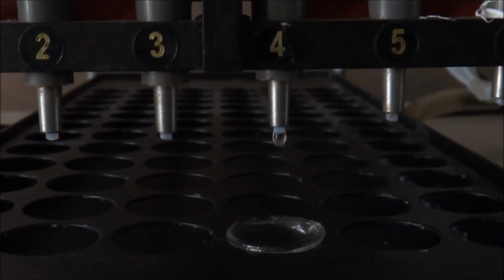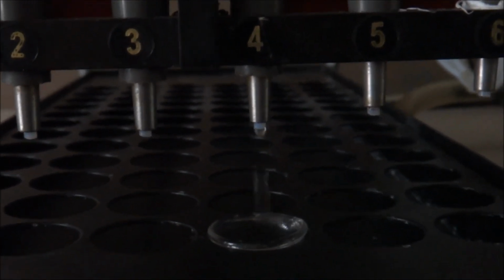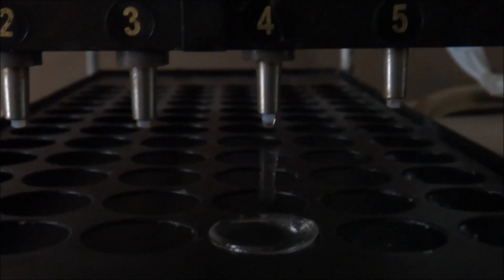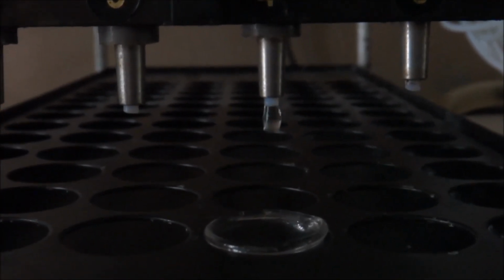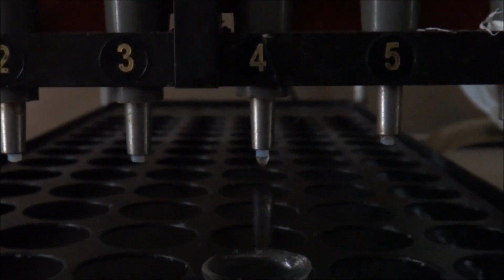Yes, so the samples started coming, and the volume is also fixed, so obviously it is going to collect 10 ml.